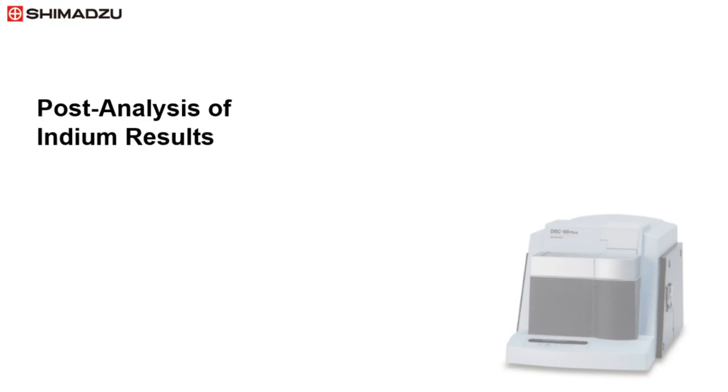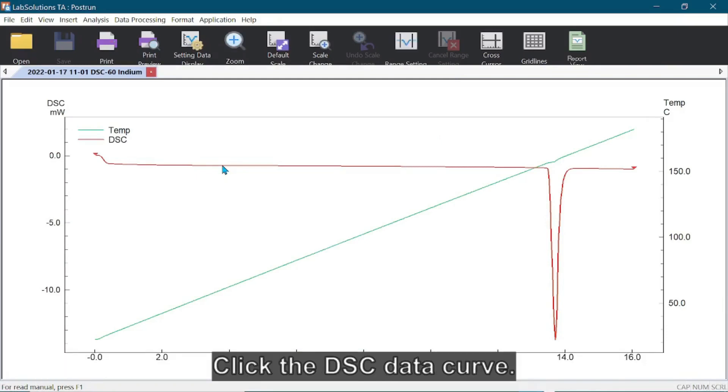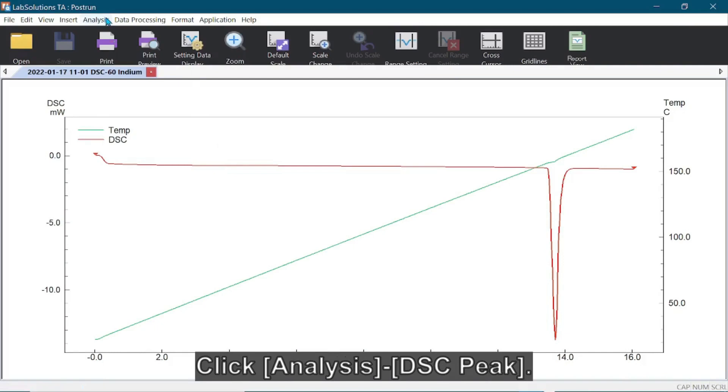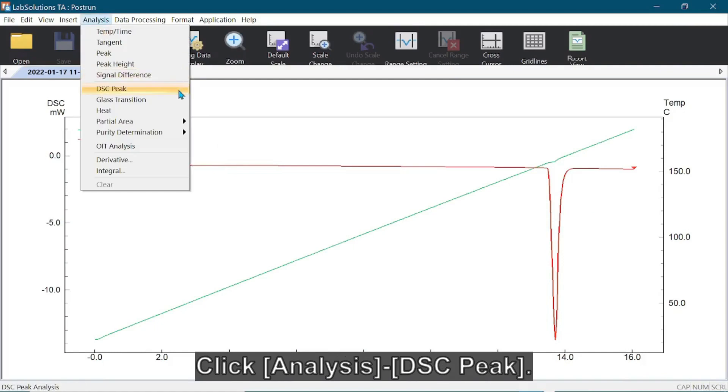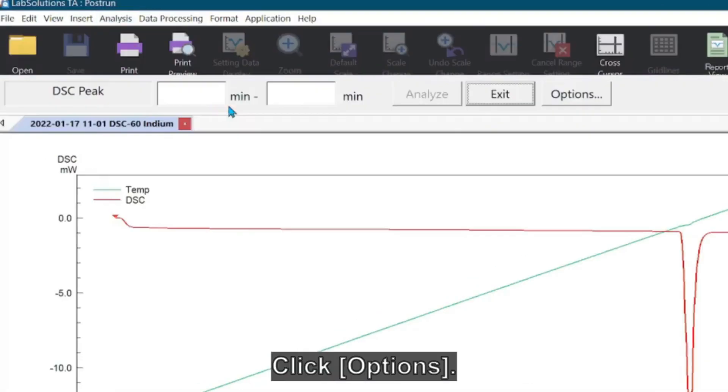The DSC results are then analyzed. In the LabSolutions TA post-run mode, open the indium data. Click the DSC data curve, click Analysis and select DSC Peak. Click Options.